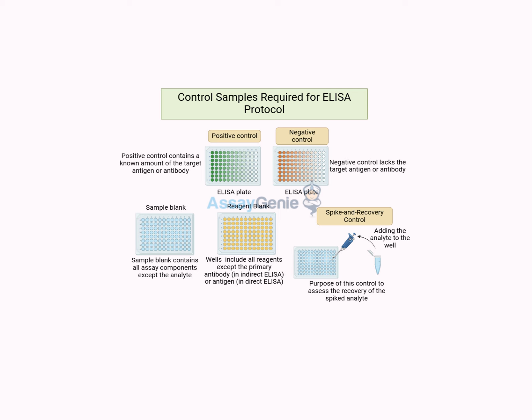You got it. And this highlights a really key point. The choice of controls depends a lot on the specific experiment and the types of samples that you're analyzing. Right. There's no one-size-fits-all approach here. Okay, that makes sense. It's about tailoring those controls to the specific needs or potential challenges of each experiment. But in all cases, these controls are like the unsung heroes working behind the scenes to make sure that the data is accurate, reliable, and trustworthy. Exactly. And that's why it's so important for researchers to understand not just the how of running an ELISA, but the why behind each of those controls and how it contributes to the overall validity of those results.